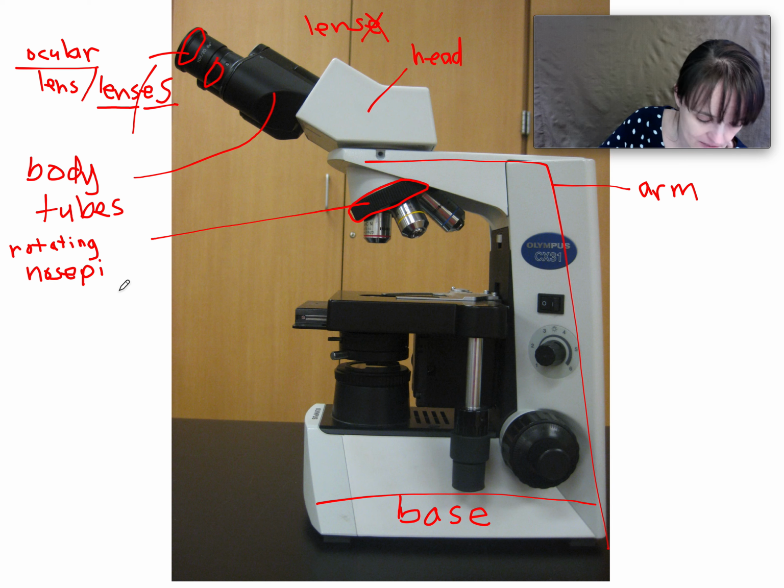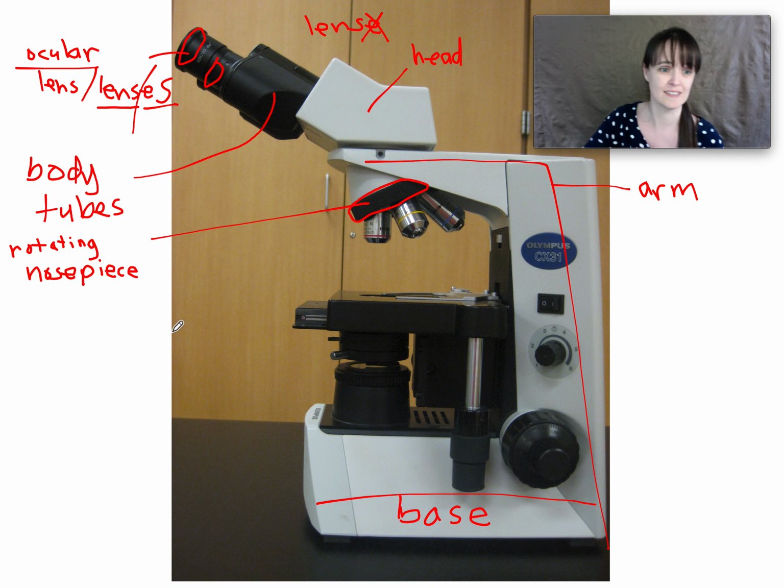It's a different spelling. I before E, except after C, unless you have a weird neighbor named Keith who insists on science. Okay, so the rotating nose piece rotates, and it does have these little nubby bits so that you can rotate it.